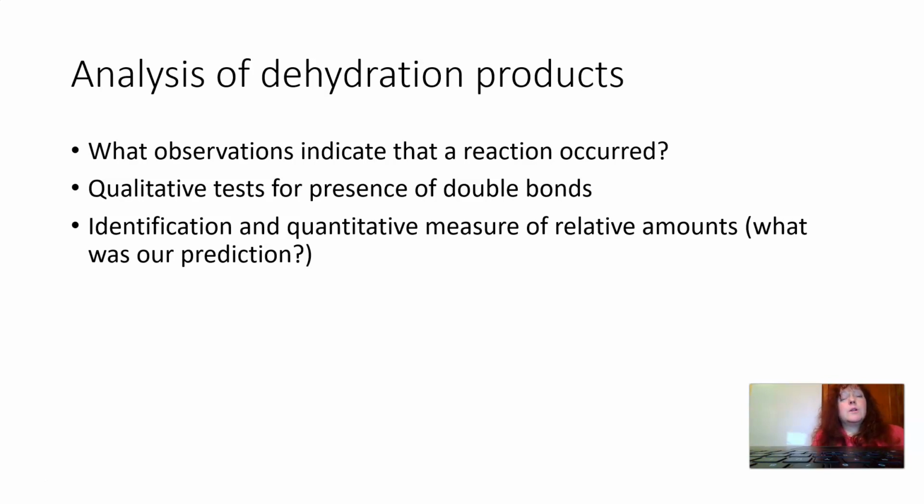Okay. You are going to do a simple distillation. I haven't written it out here. We've covered this before. You have a fairly pure material that you're going to put through a simple distillation and collect anything over 100. So you're obviously excluding any water that may still be in there after the drying step with the drying reagent. And you're going to collect that up to as many milliliters as you can get without it going over 115 degrees.